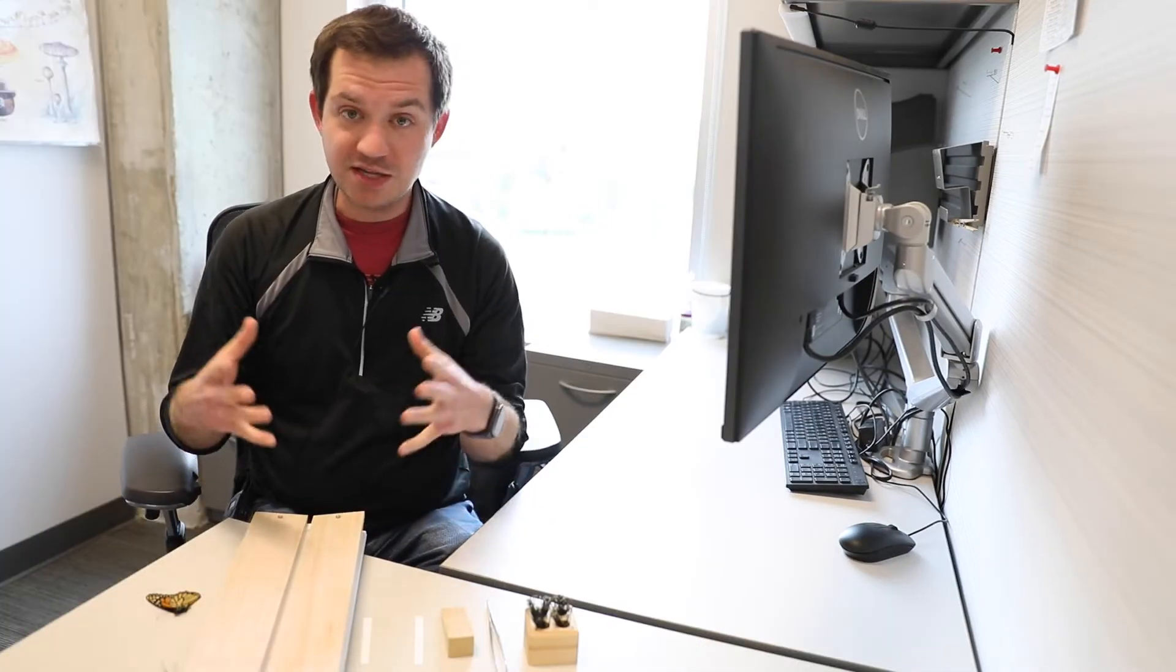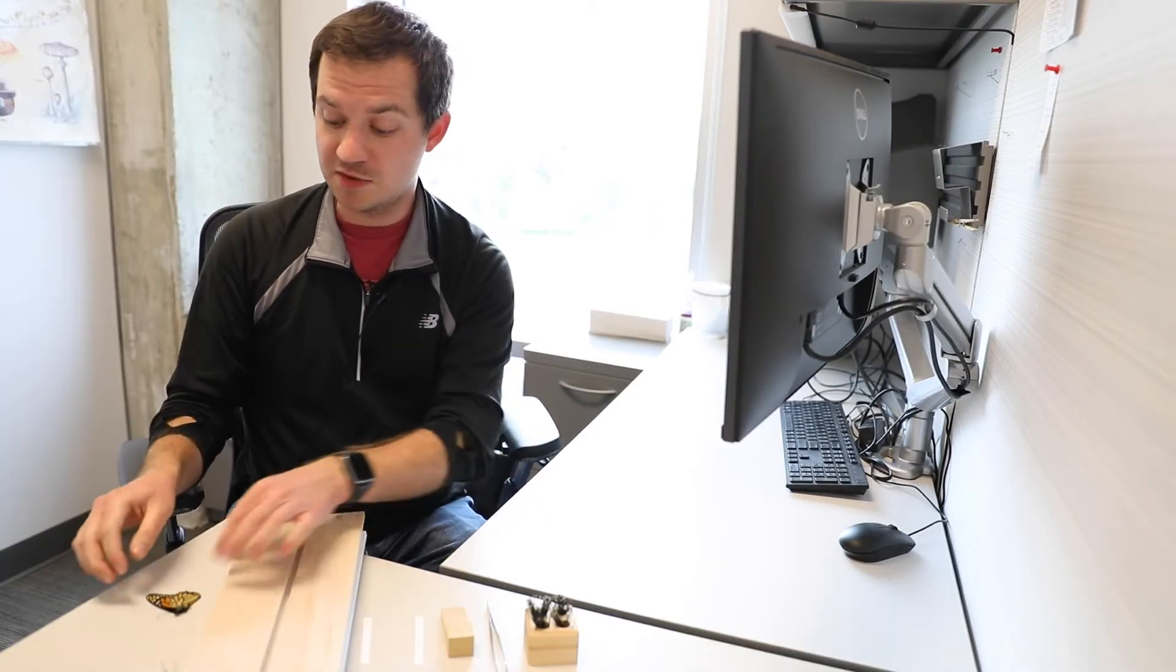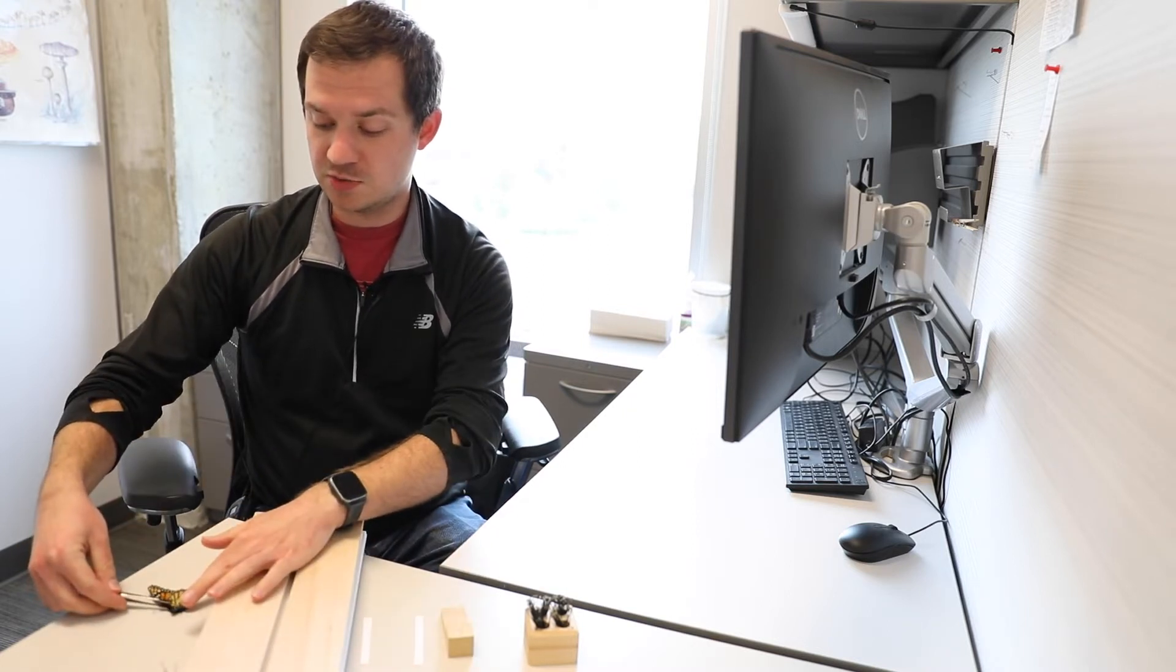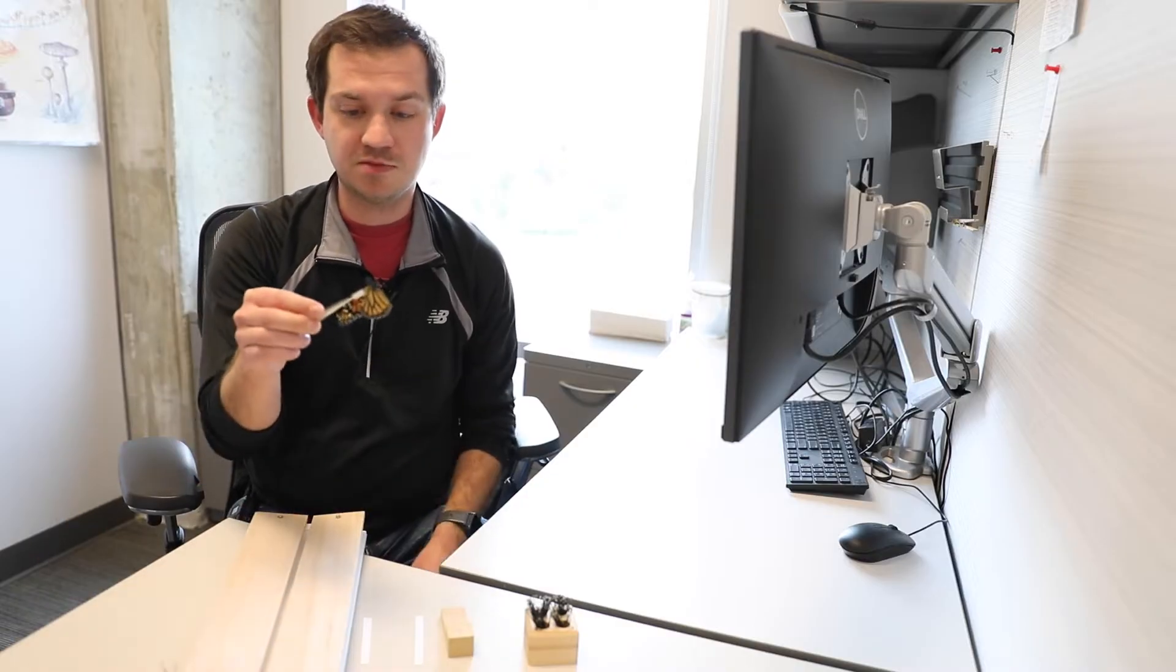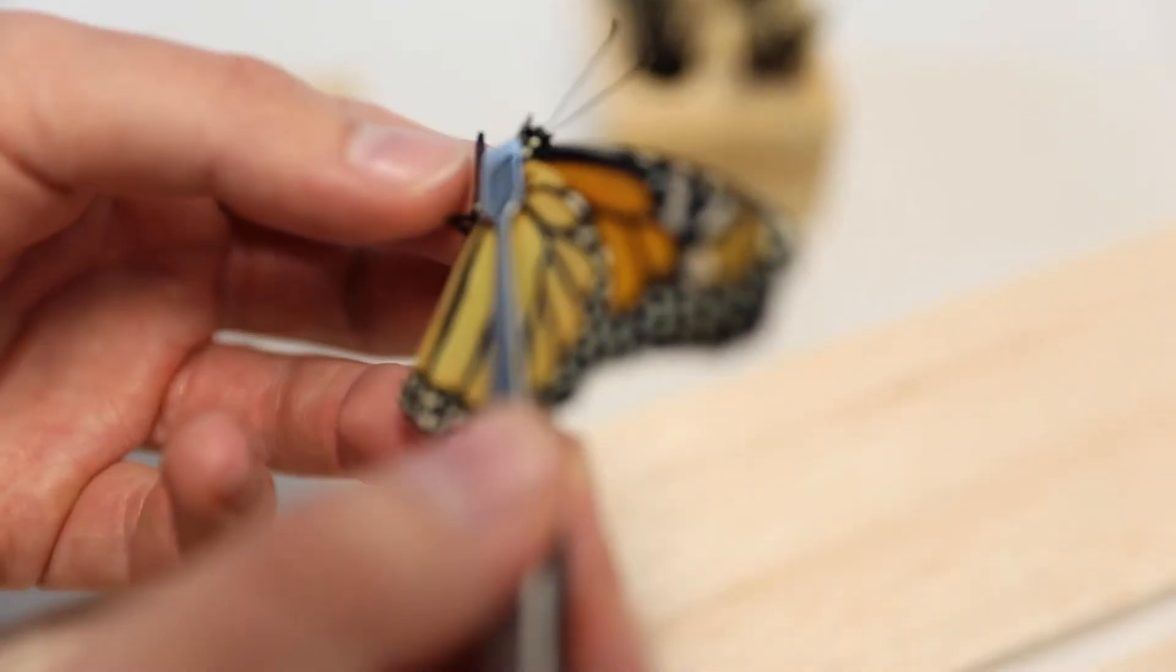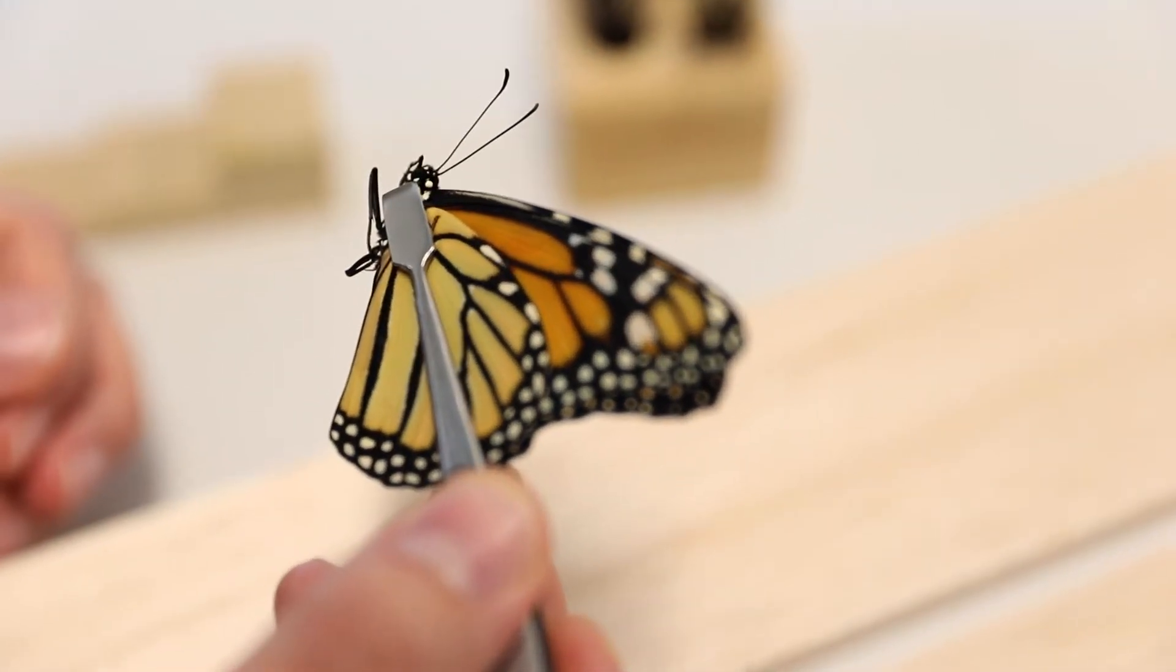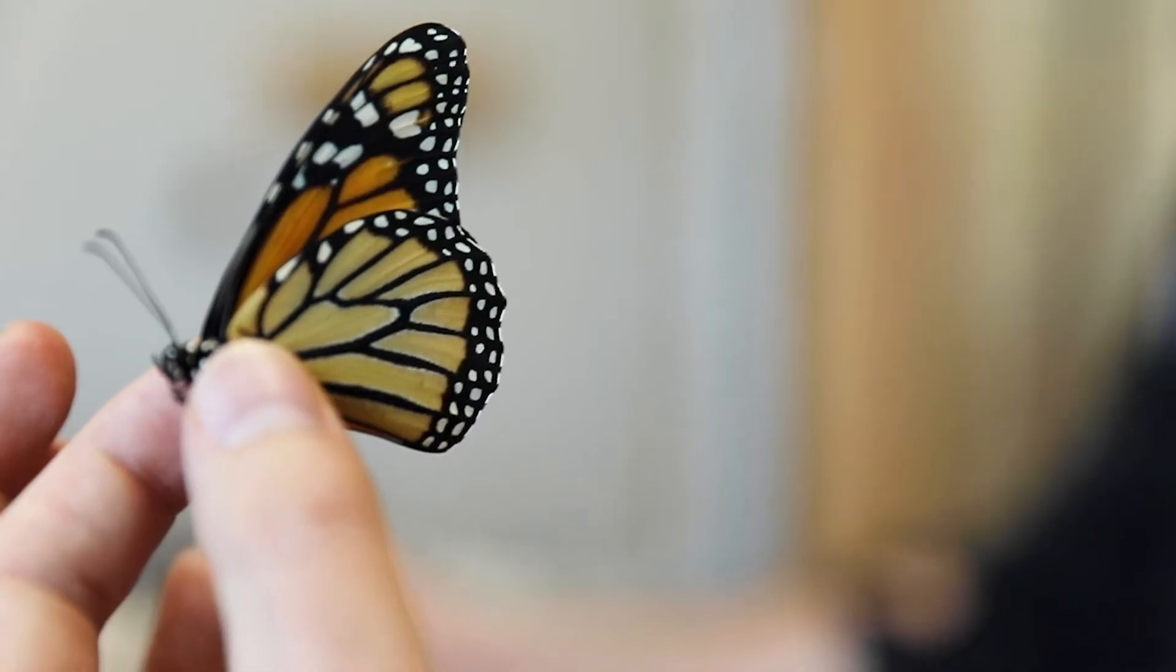That's all you really need for basic butterfly pinning and spreading. Some words to the wise: when you're picking up and manipulating a butterfly specimen, you either want to grip it by the front veins on the forewings - those are the thickest veins on the butterfly - so you're gonna limit the amount of damage you're potentially doing. If you're grabbing it with your hand, it's always just best to grip it by the body. You don't want to squeeze it, just gently grab the butterfly.